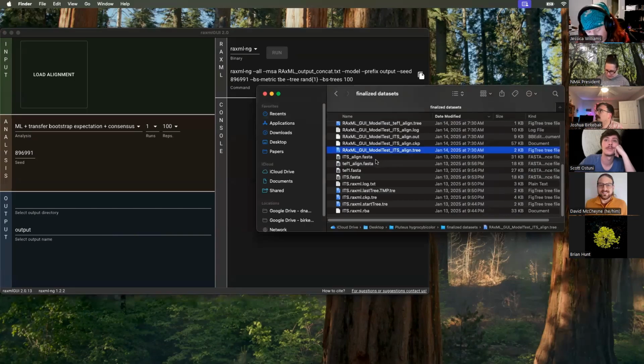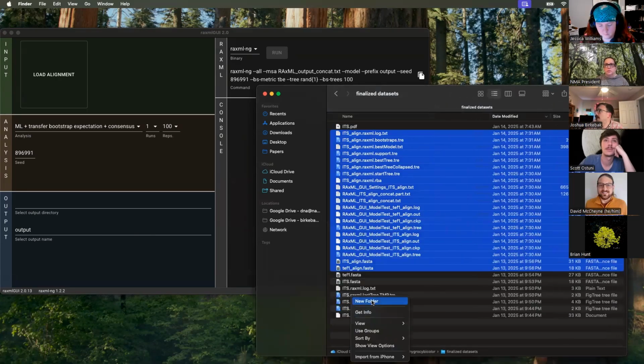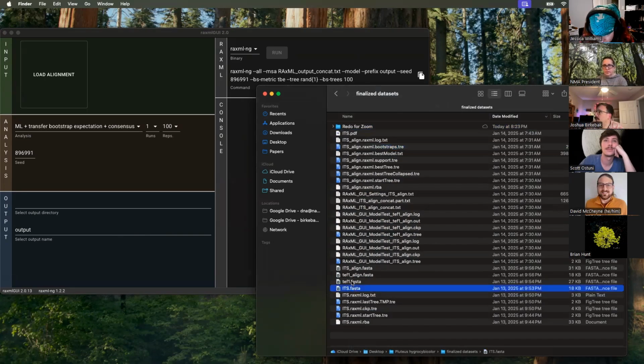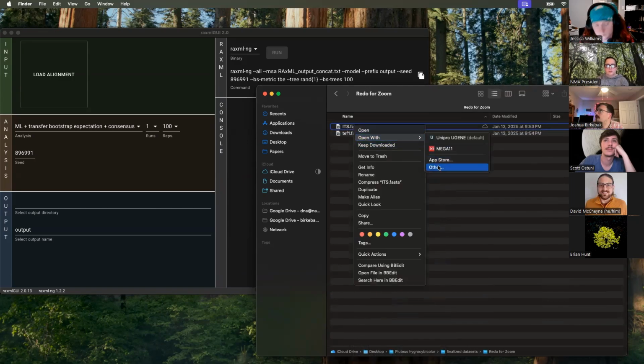And actually, let's go ahead and remake these alignments, because there's some interesting stuff to be made here. I do want to keep those original ones just in case something funky happens. So we're going to copy, paste two items. Okay, so ITS is going to be the same.